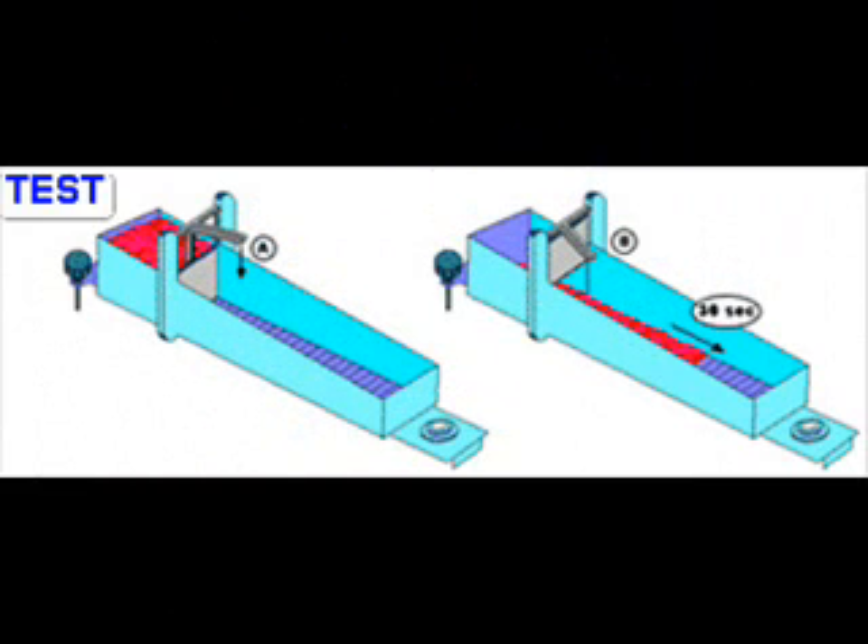To start a test, you pick up your timing device, probably a stopwatch. Then simultaneously start the stopwatch and push down on lever A. This gets the gate open and starts the sample flowing down the consistometer trough.